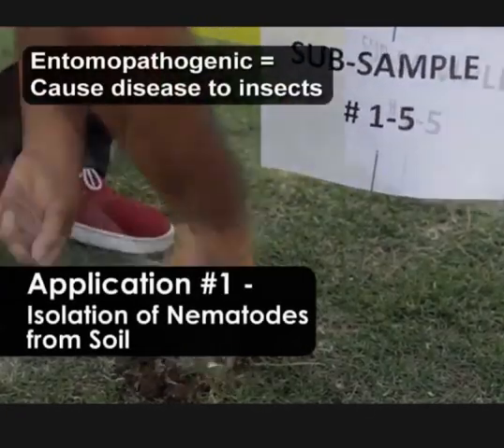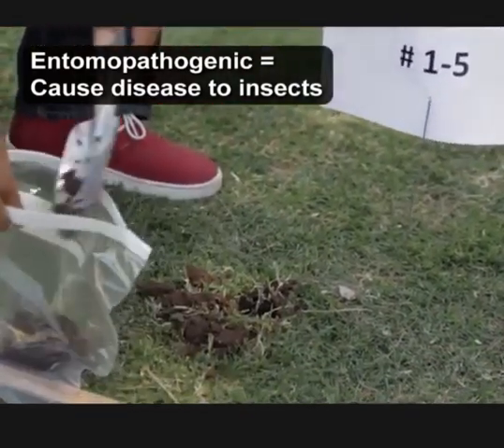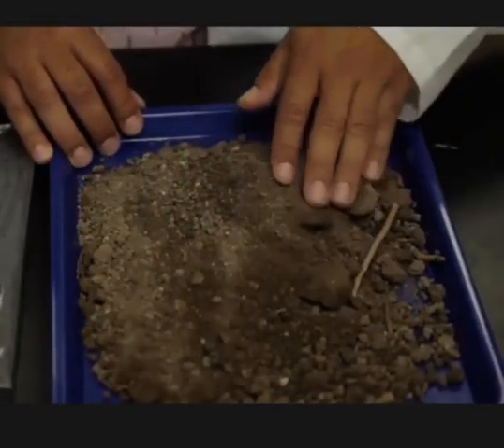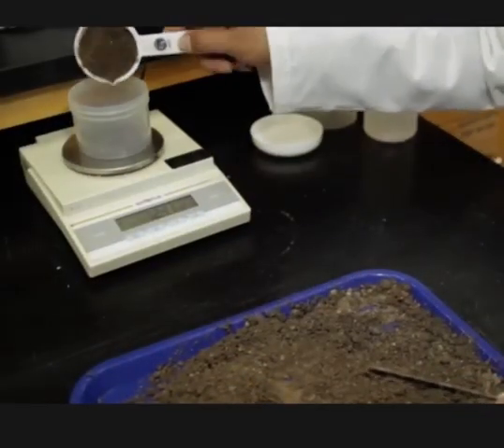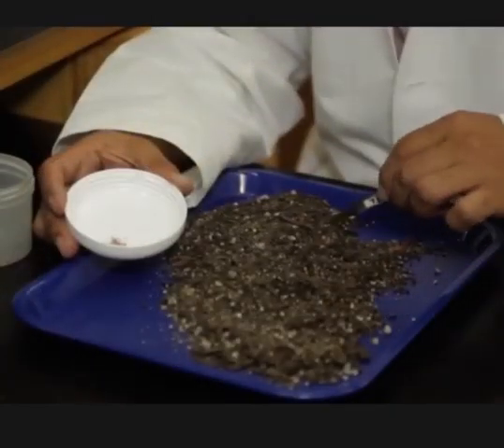Entomopathogenic nematodes are microscopic roundworms that parasitize insects. While they are not visualized in the contact slide assay, they can be isolated from collected soil samples, as shown in this example. First, the nematodes were baited in the soil using insects identified from visual examination.